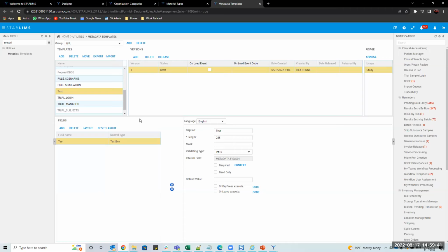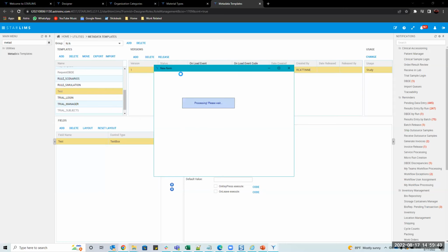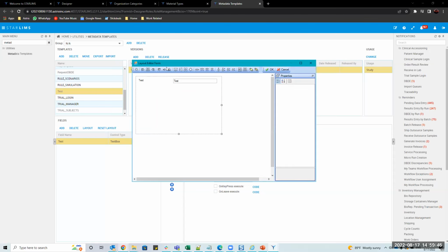It takes long, and then this opens and right away it looks different, right? It doesn't look like this white with these icons and things. So this is a bridge form because this did not get converted. They kept this as it was, which is the old XFD. And when you click this button, there's code on this form that opens it up in a bridge.